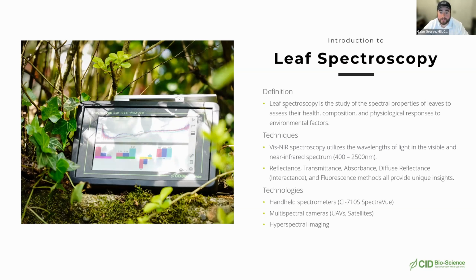The next question is, can we update the CI-710s software? Yes, we do provide software updates for free. And in fact, we do have a new software update for current users of the device. So if you currently own a device and you want to update your software, then please reach out to us and we will make sure we get that updated. I put the link in the chat for the software update. Awesome. Perfect. Well, then that's where I would go to check it out. And if you own a device already, please update your software. This is a great update that fixes some existing bugs, but also addresses some enhancements to the actual software itself. So I would highly recommend it.